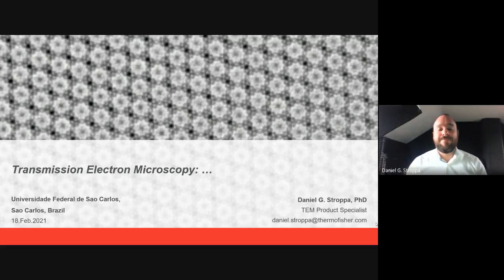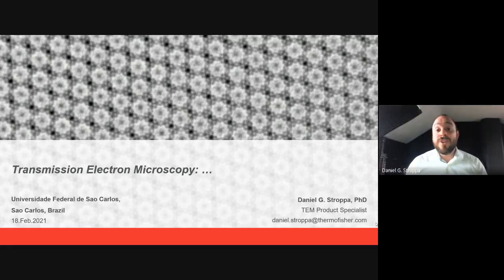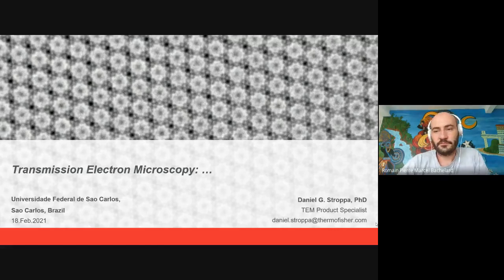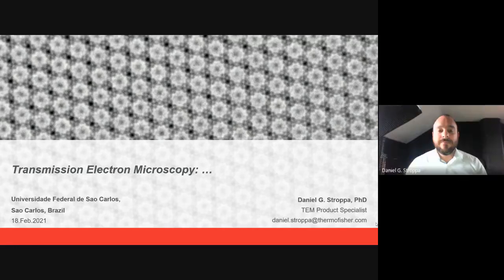So Daniel, just a quick question regarding when you were showing the slices, you said that you have to select the slices very neatly so you can have less than a 2 pi change in the phase of the electrons, right? So what you just presented, now this new technique is correcting that, right? In a way. No, actually, that multi-slice story is just a way that I find easier to present, so you understand how the electrons are feeling the effect of the sample.